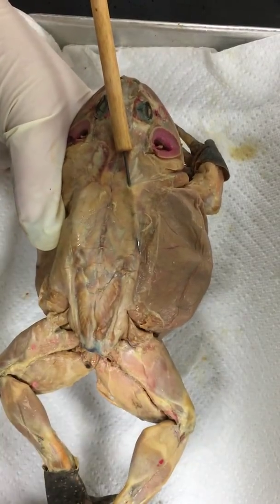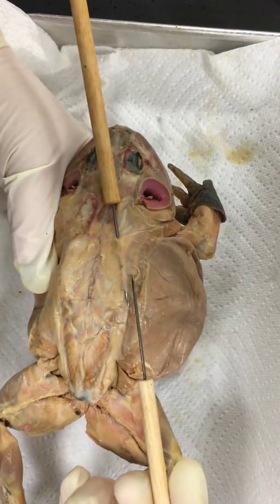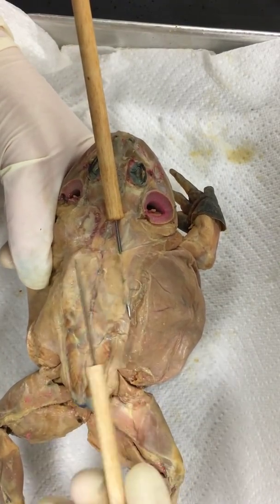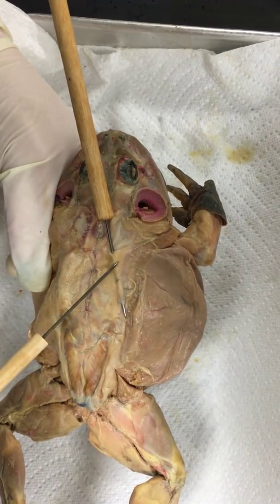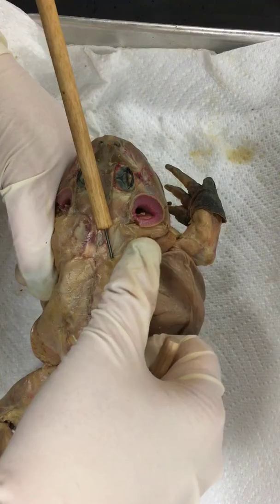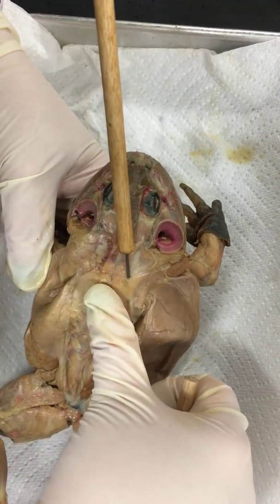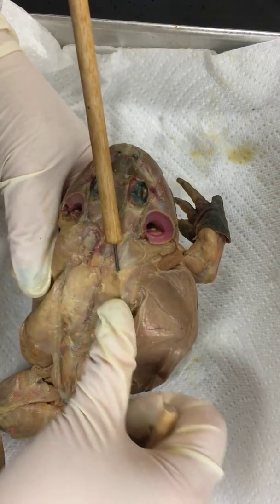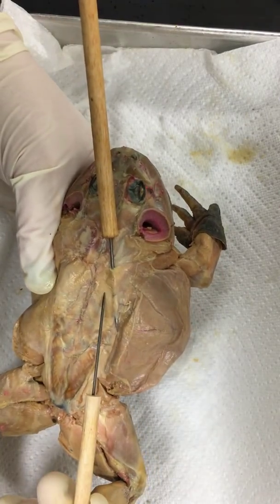This muscle that I have marked here comes right over the shoulder. It's a pretty thick muscle, so if you were to take your thumb and pull over and drag across, kind of making it almost a V or butterfly shape — that is your latissimus dorsi.